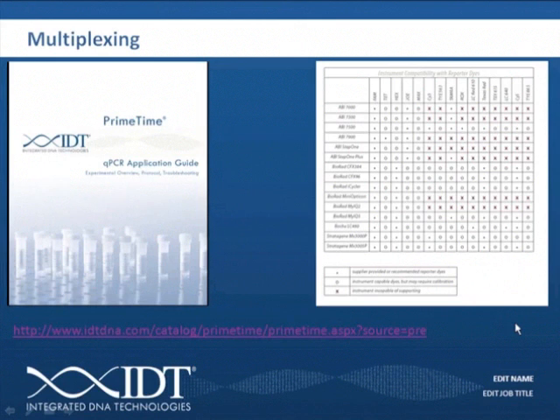So you don't want your probe sequence and your primer sequence to overlap, but they can be designed on either strand. Okay, so it doesn't matter which strand you use. Yeah. The more important thing is TM and making sure it's the right TM. So you're just matching up the TMs, those parameters you discussed earlier, first.